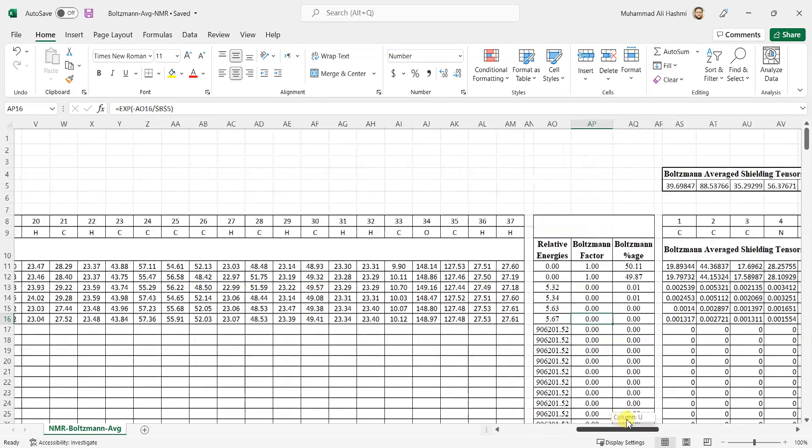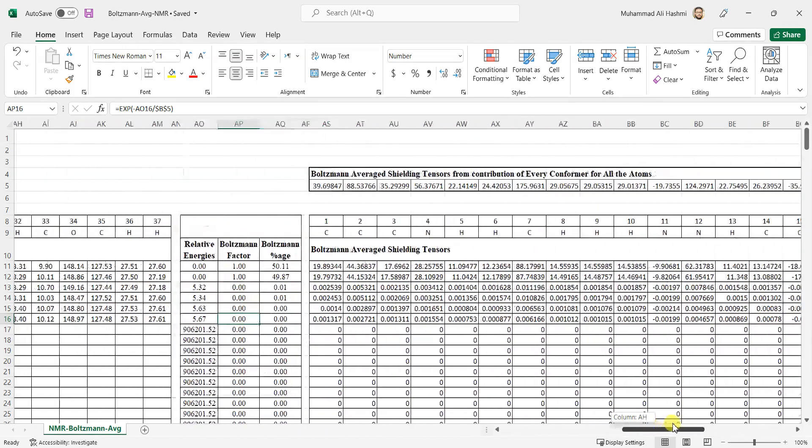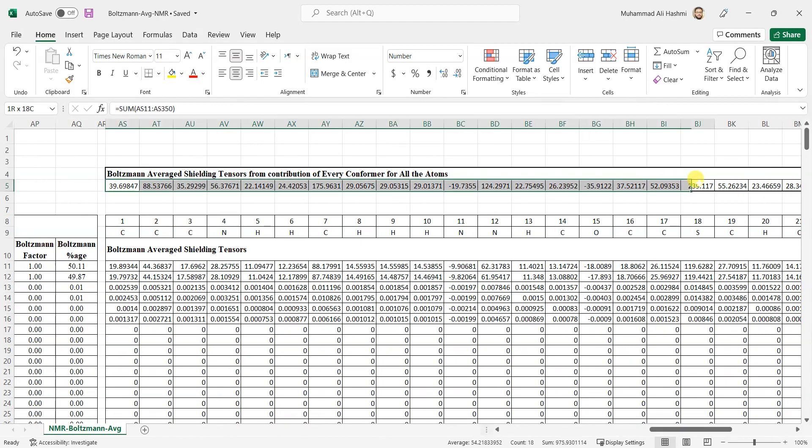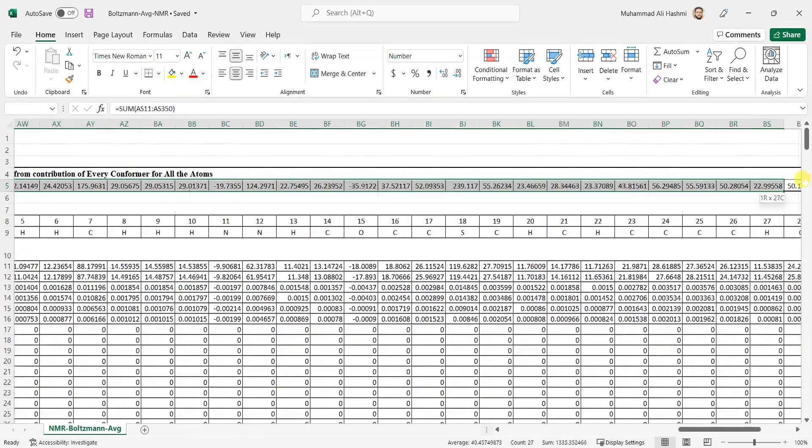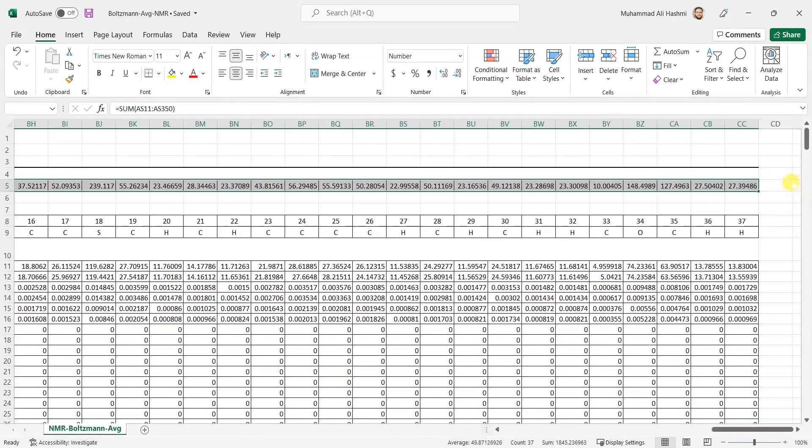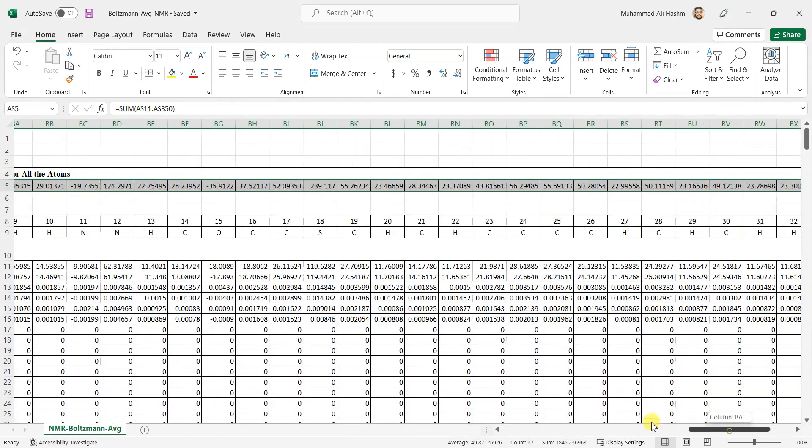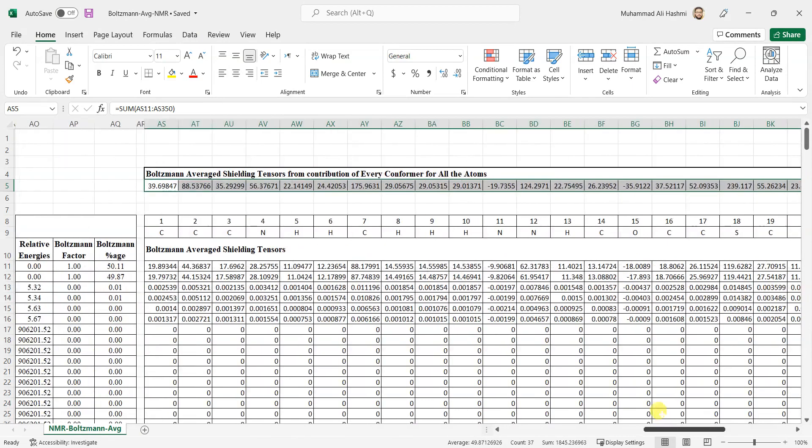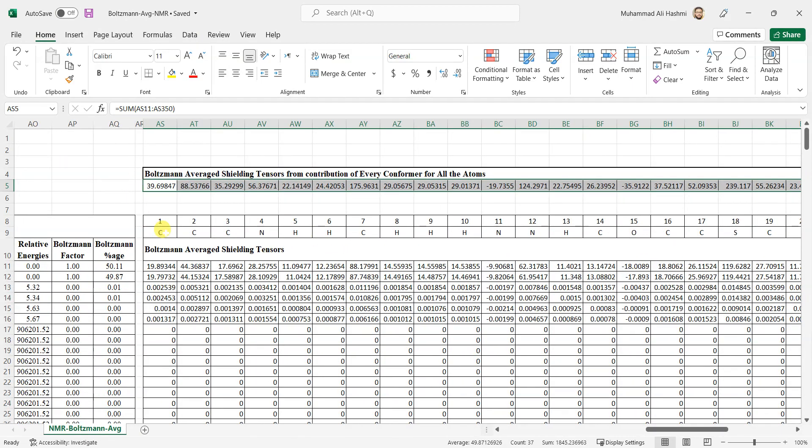Now if you scroll to the right, you can see that these are all the calculations and then here are the shielding tensors that have been Boltzmann averaged for all these atom numbers and their symbols. Now you can simply copy them wherever you want. For this carbon atom, which number is 1, its average shielding tensor is 39.69847. Similarly for this one, and then similarly so on.